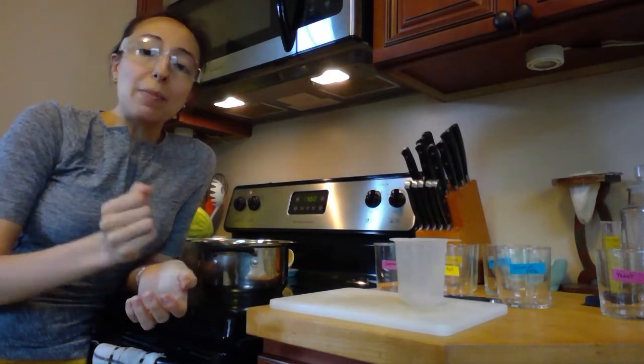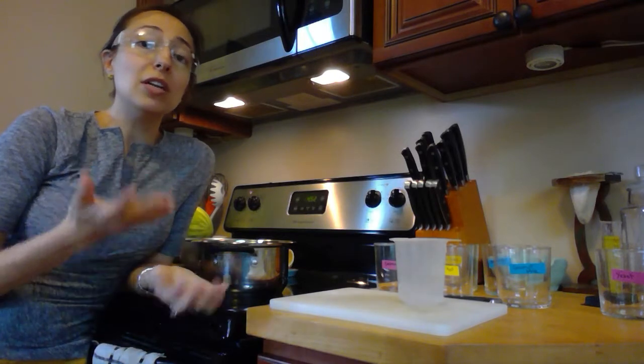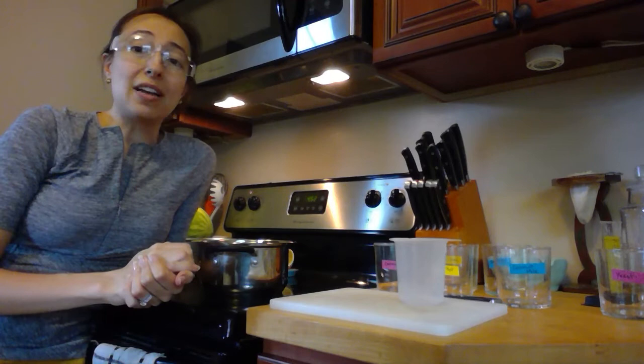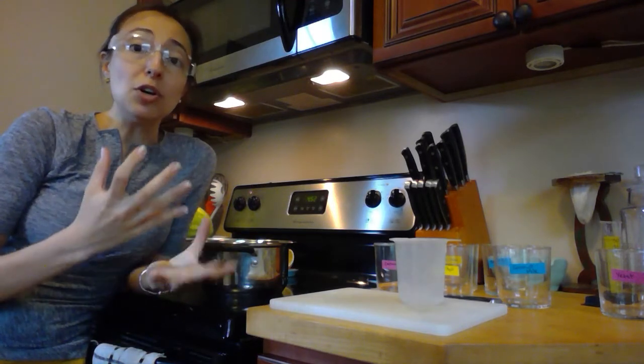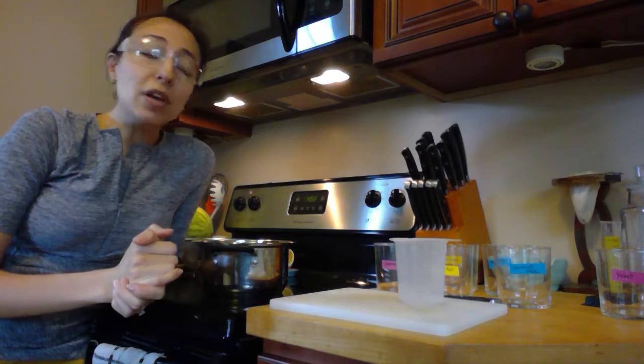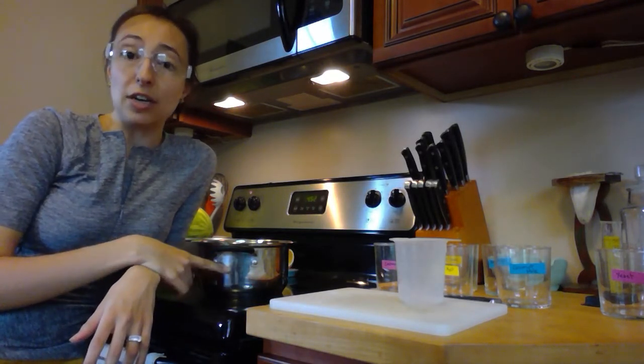The more of that powder you add, the stronger it's going to be, the higher the molarity, the stronger the concentration. So your procedure doesn't tell you exactly how much to add. That's for you to experiment with. Maybe just a couple teaspoons will be fine, but you can play around with it and see if you add more, if that changes the color of your indicator.